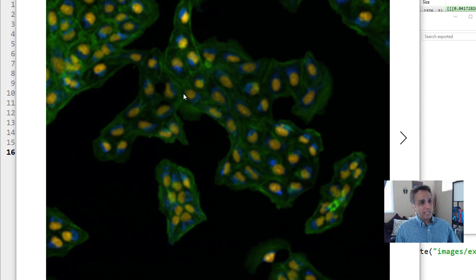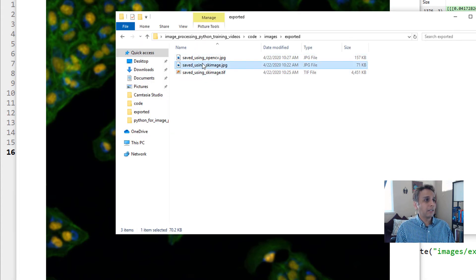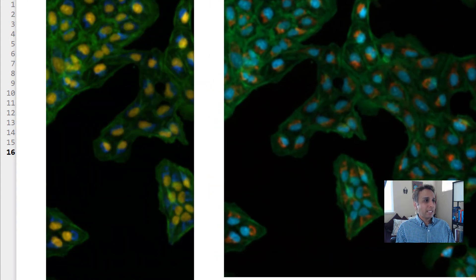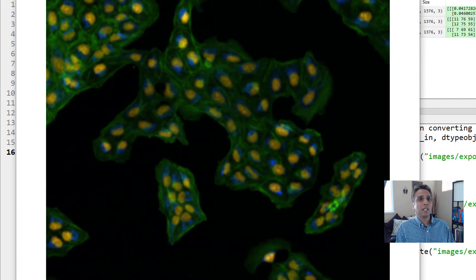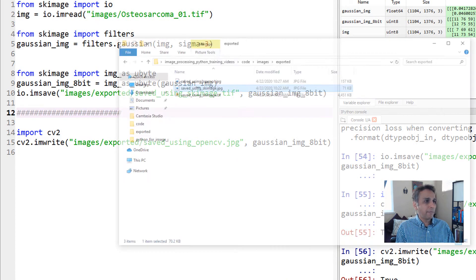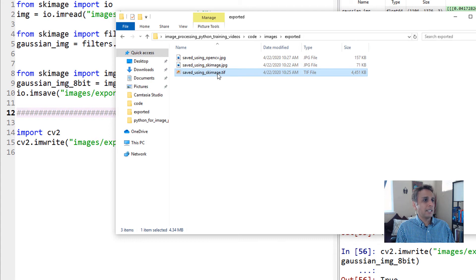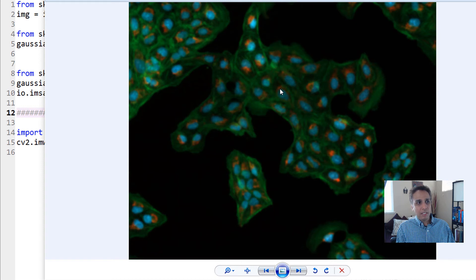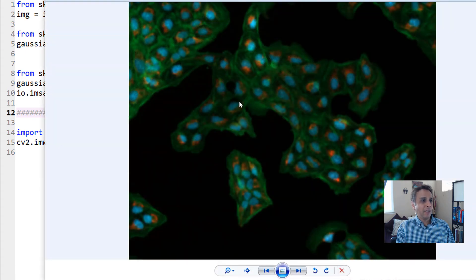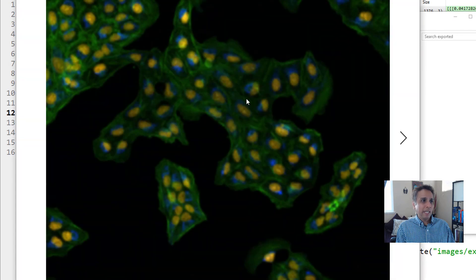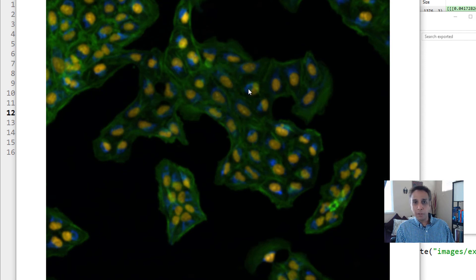Now that we're converting and saving the 8-bit image as JPEG, this line should execute and the image should have meaning. You may notice that in the scikit-image saved image, the nuclei show up in blue with red and green regions clearly visible. But if I open my OpenCV image, the nuclei part is showing up in yellow and the red part in blue.